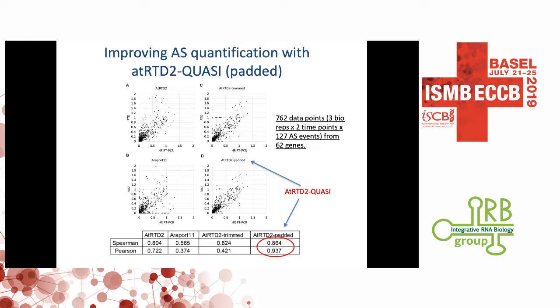So here are actually the ratios. We calculate the ratios of that specific event divided by the protein coding transcript. Then we have all these ratios over here. Then, of course, you can do the same with the RNA-seq quantification coming from Salmon as well. Mm-hmm. Okay. So you basically just look at the correlations. I see. Okay, yeah, we can take it more offline.